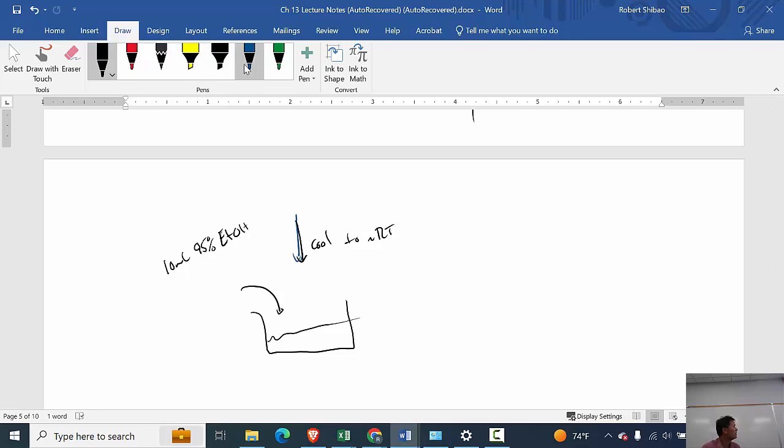What I'm going to say is this. We're going to modify the procedure a little bit. This is minimum. Add more to maximize precipitate. So what we're doing is we're doing the metathesis, reaction 3, in which we want to precipitate out the solid. And the solid is going to precipitate out as a hydrate because there's water around.